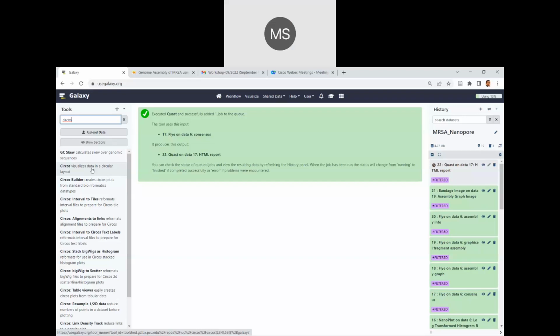Most of the tools that are there are now populated here. That is the advantage that you have. But the only disadvantage with Galaxy is it is going to take time. We are still working on a very small set of data. If you have a very large set of data, it may be very exhaustive and it may not work out. So let's come to what you require if you want to be a data scientist and be in genomics.